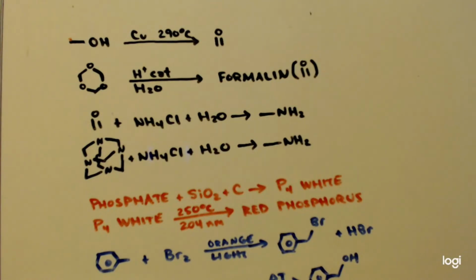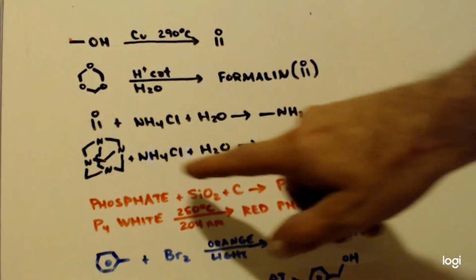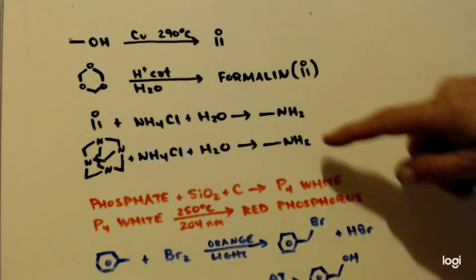Then I'm going to take some hexamine, some ammonium chloride and water, and you don't even need ammonium chloride, you just need water. But I'm going to add a little bit in because the more you have in there, the better it is. And try to make methylamine. I don't have it in the equation there, but I would use hydrochloric acid to hydrolyze the hexamine into formaldehyde and ammonium chloride.